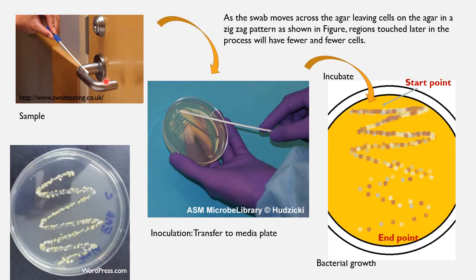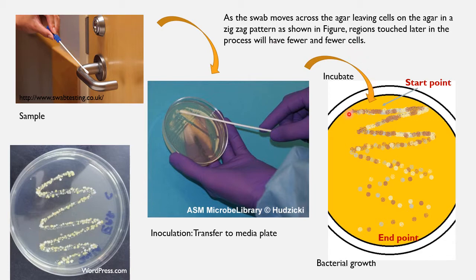Take a swab sample from a normal doorknob. You use that swab — which now contains your sample — for inoculation in a zigzag pattern. As the swab moves across the agar, cells from the swab are transferred and deposited onto the agar plate in a zigzag pattern. Regions which are touched later in the process will have fewer and fewer cells. The first streak region will have the highest growth or aggregated colonies.